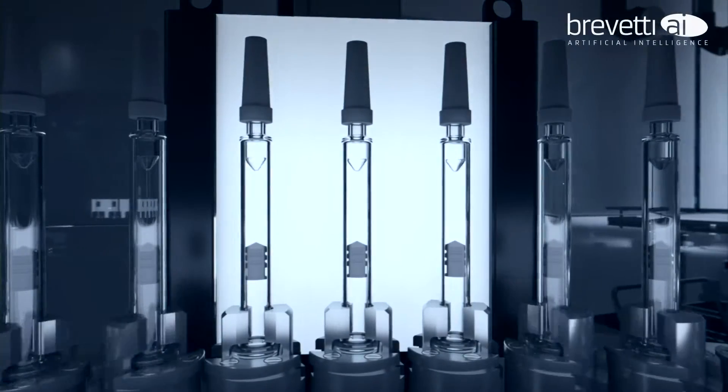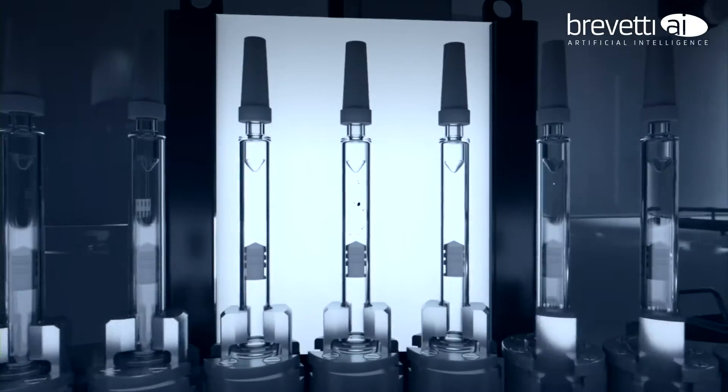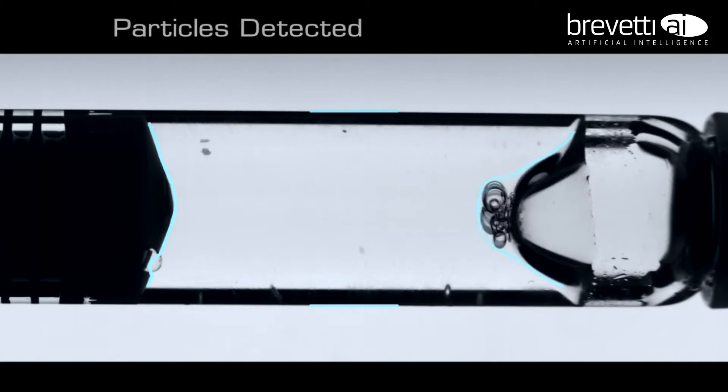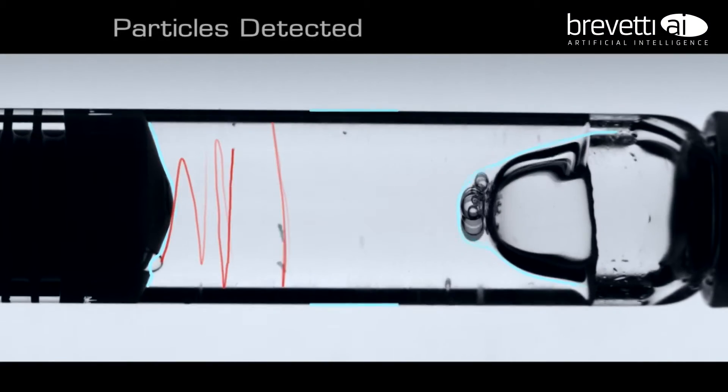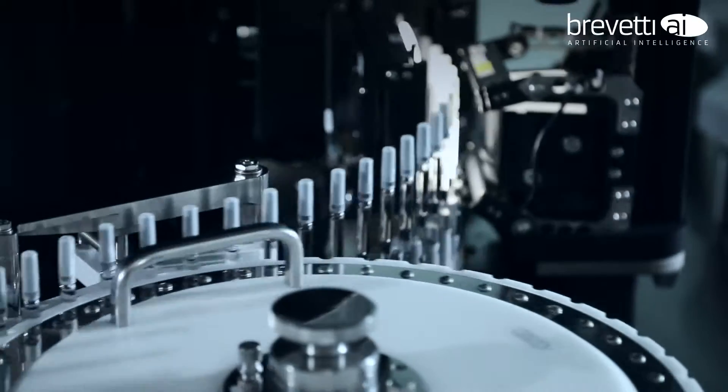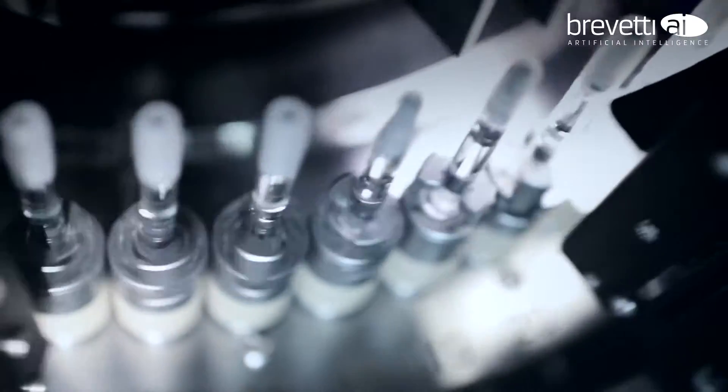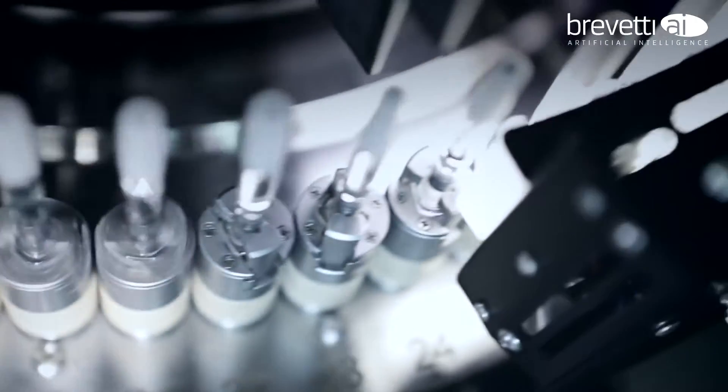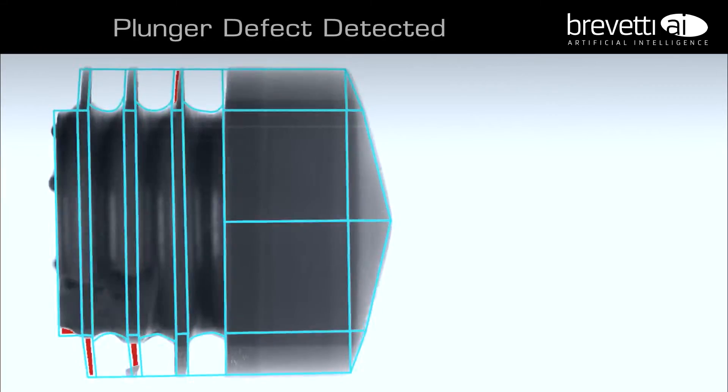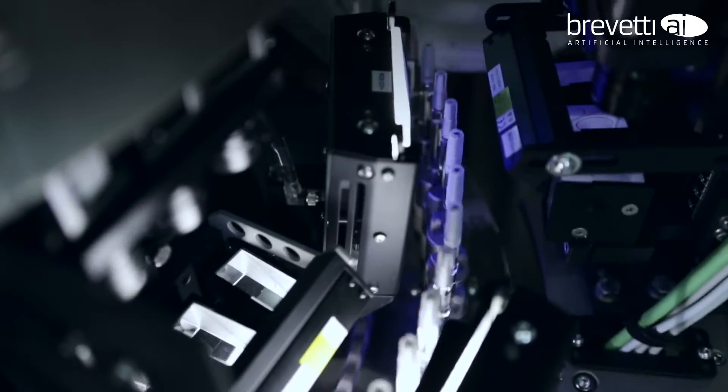Particle detection based on image differentiation, thresholding and blob classification through physical features, is now used in combination with Breveti Chea Particle Trajectory Tracking, based on background subtraction, blob extraction and motion prediction, to reach higher efficiency and reduce false rejection.